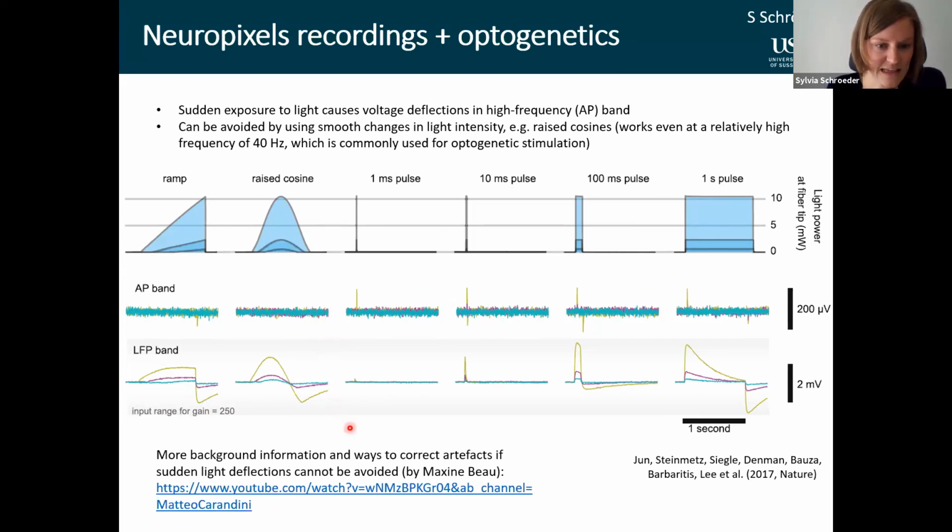If you're interested in this, or also want to use optogenetics but have to use these kinds of step changes, then I really recommend this video by Maxime Beau, who used this method and tells us about some tricks he used to get around these artifacts.